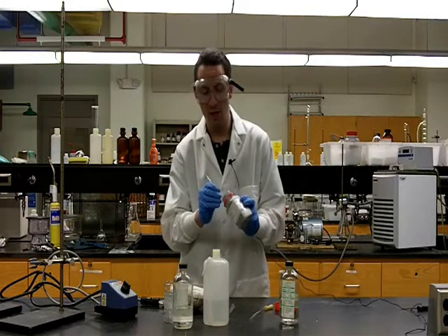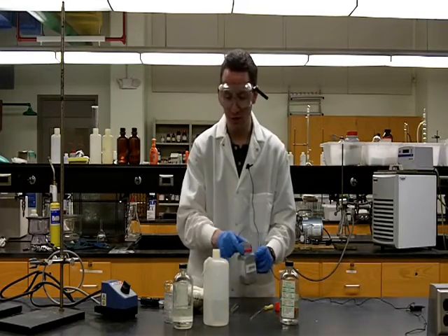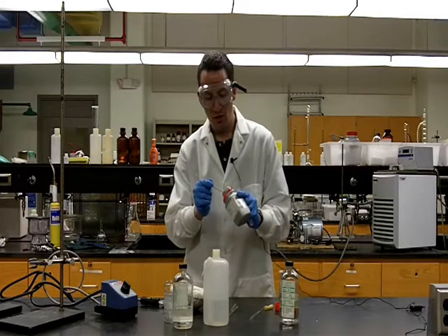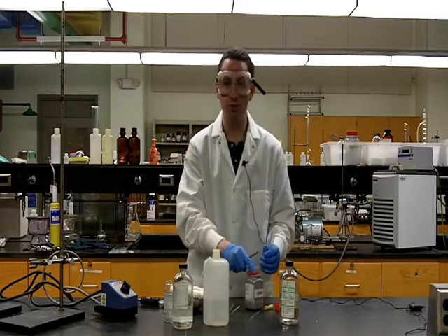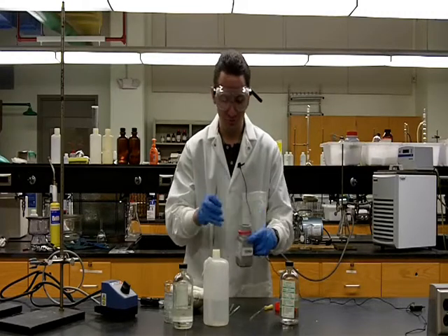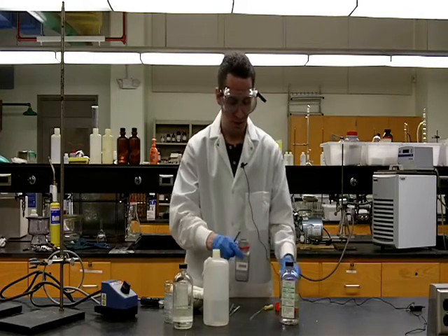So in this demonstration, we are going to use the solid compound fluorene, and please note this is the organic compound fluorene and not the element fluorine, and three different solvents, toluene, water, and methanol, to gauge their appropriateness as a solvent for this recrystallization. So first, I'm just measuring out a small amount of fluorene into each of three test tubes, and each test tube will get one of the three solvents to test for solubility purposes for recrystallization.